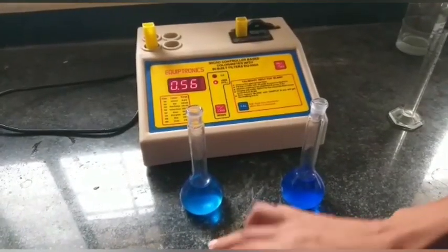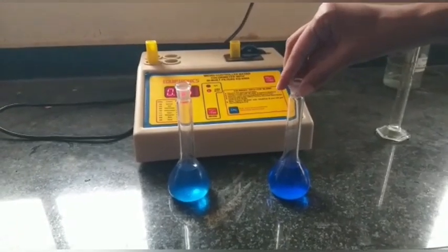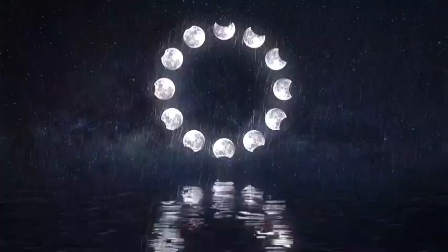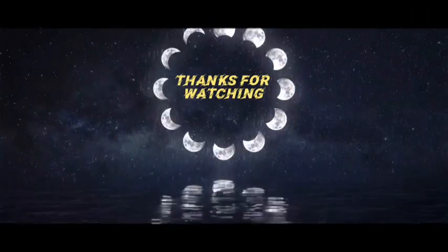For higher concentration, we show 0.56 absorbance. Thank you.